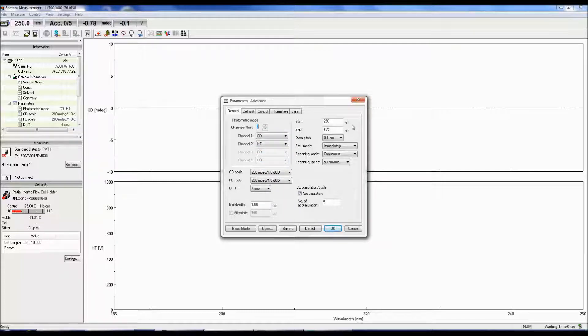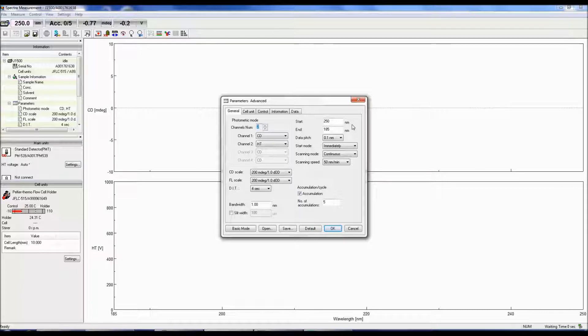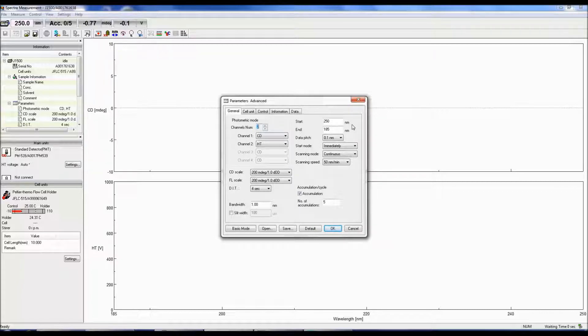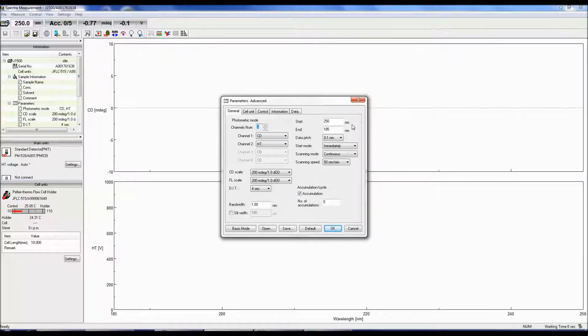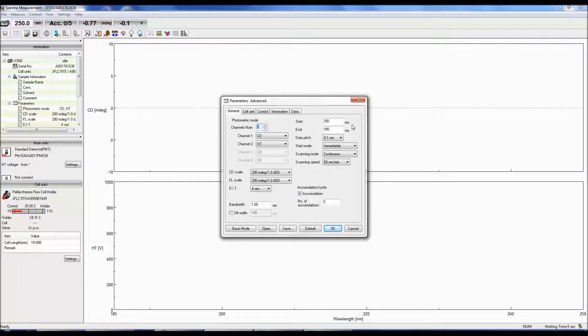The start and end fields determine the wavelength range for the measurement. Secondary structure measurements are obtained between 185 to 250 nanometers, while tertiary structure information is acquired between 250 to 350 nanometers.